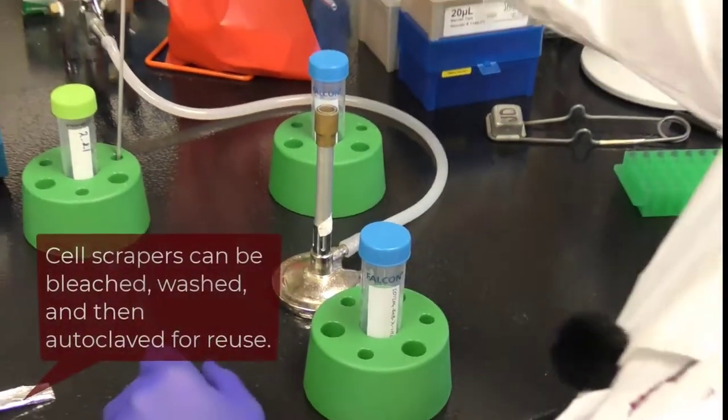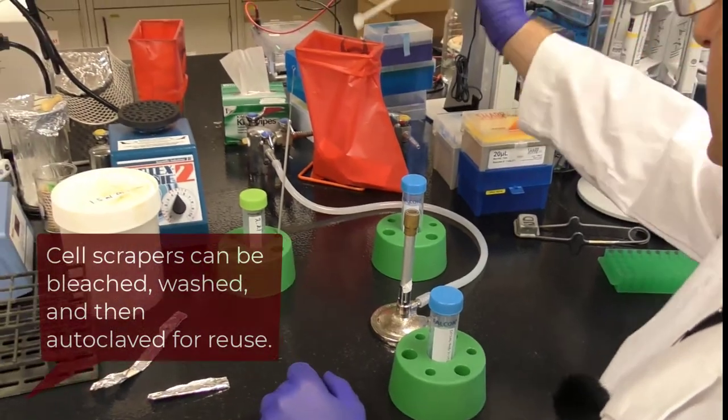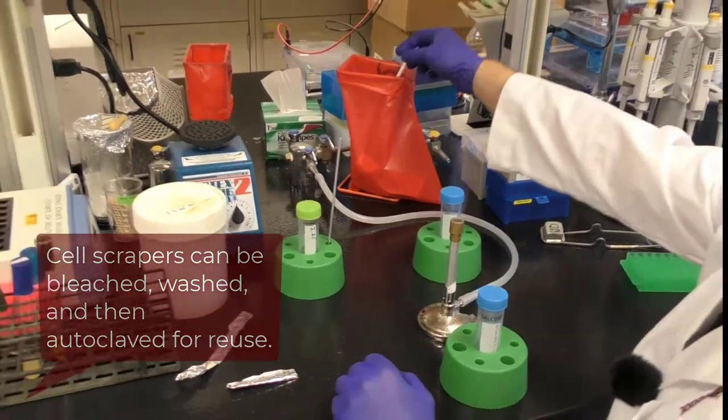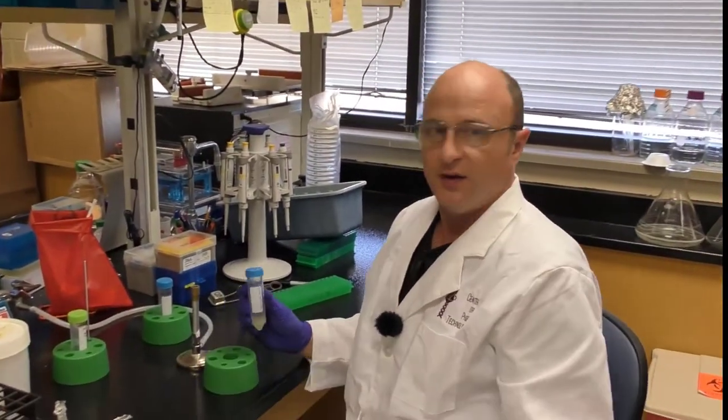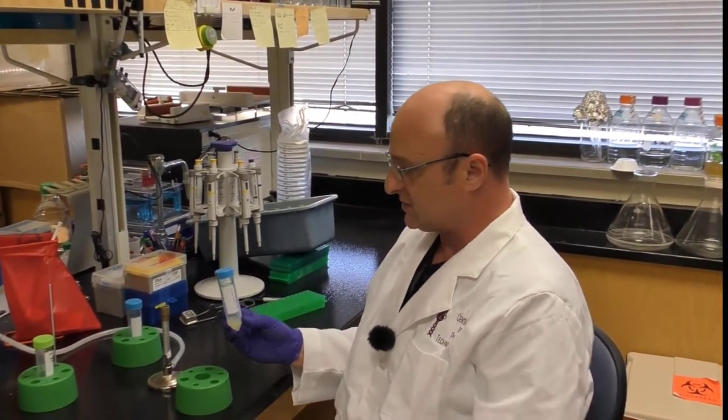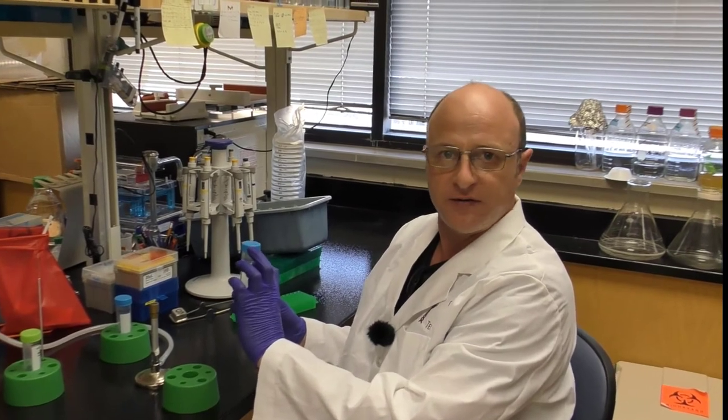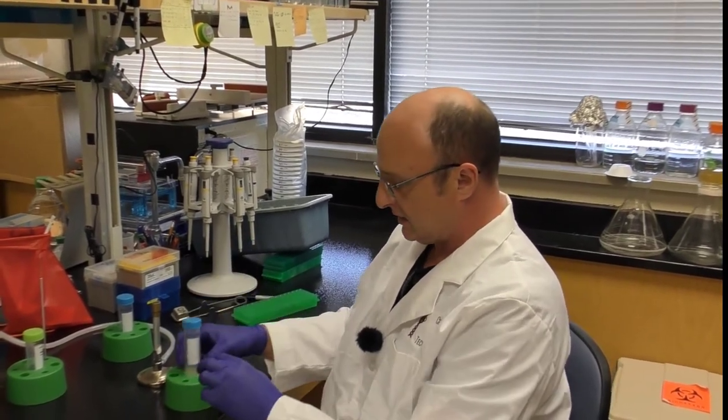That can go into the biohazard. These will be reused, so they shouldn't be put in here. But this tube is ready. Now you will repeat this four more times. So you're going to have sort of 20, 25 odd or nearly 50 mils in here. And then it gets centrifuged.